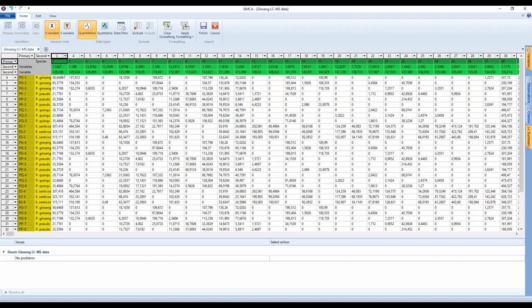The same applies to your mass charge. So we had to come up with dummy variables, or just generate automatic variables that are linked to each and every one of these pairs. That's why you see 1, 2, 3, 4, 5, but this is just something that we automatically generated. The most important variables are these, and we assign them as secondary variables.